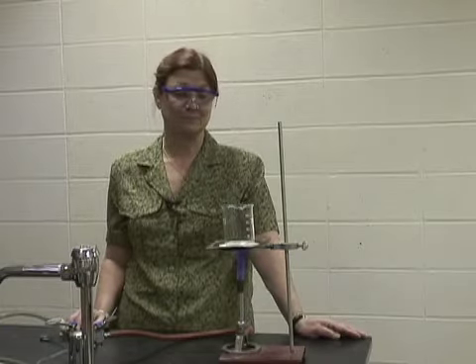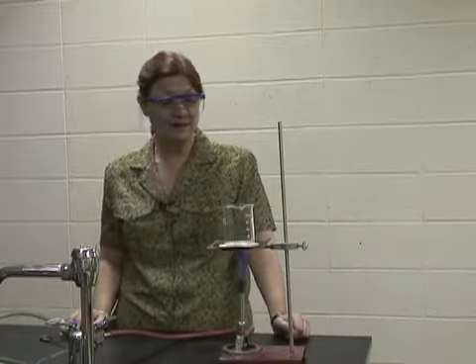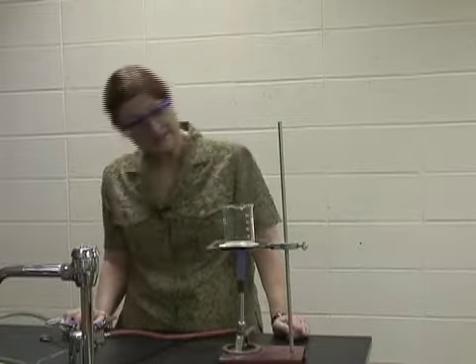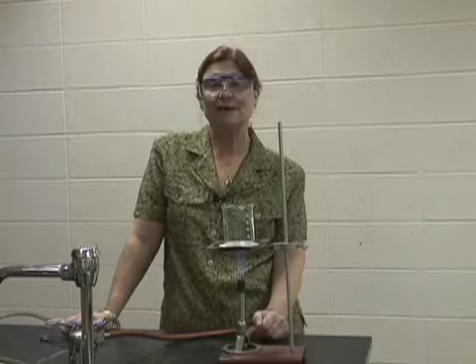It is evaporating. It just takes some time for that liquid to totally go away and leave us with the crystal.